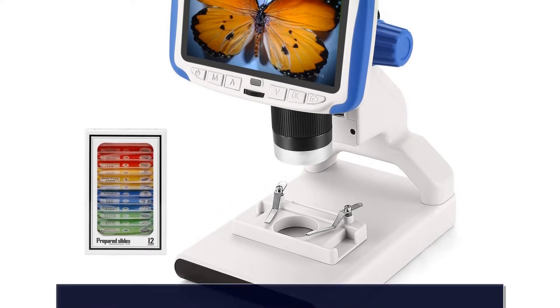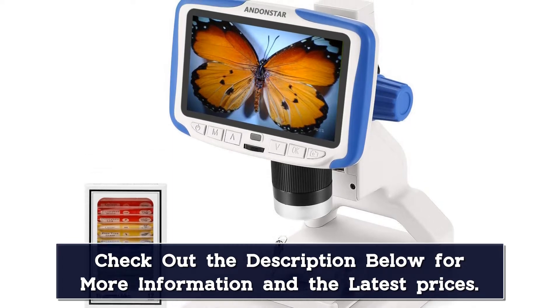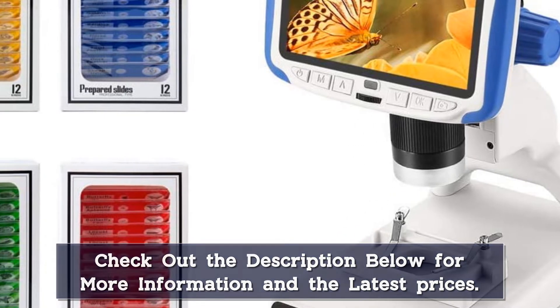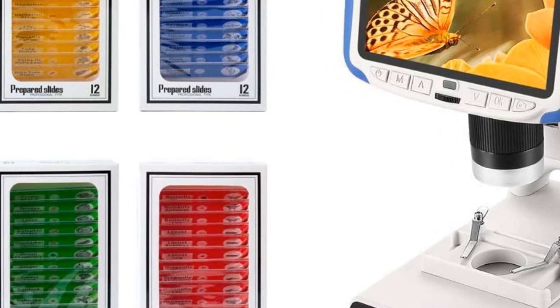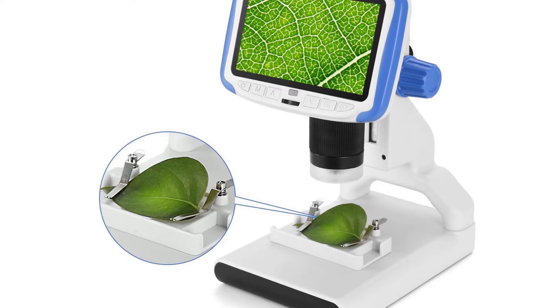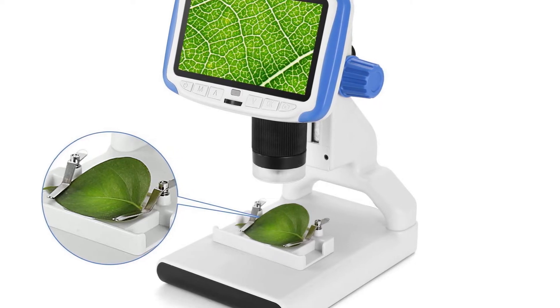A yellow plant slide kit includes phlox leaf, lily pollen, veins of holly leaf, dandelion fuzz, agar, laver, camellia pollen, sunflower pollen, tulip pollen, pine tree stem, bamboo cane, and carnation stem. A blue animal slide kit includes plankton egg, canary feather, pigeon feather, rabbit hair, cow hair, cat hair, goldfish scale, sardine scale, horse hair, fowl feather, duck feather, and sheep hair.